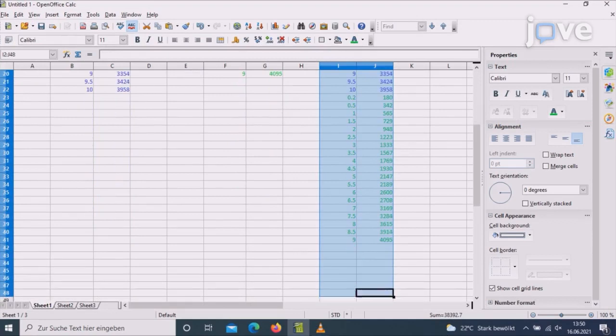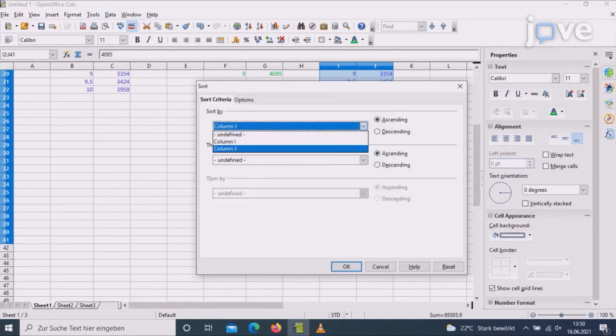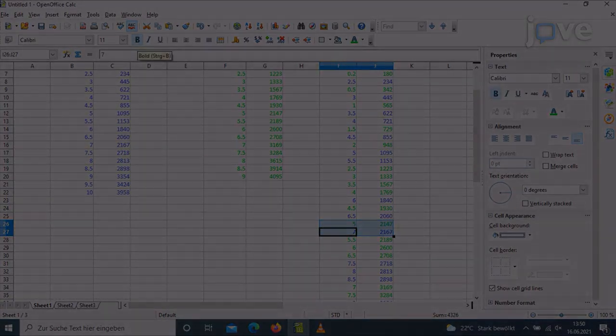For data evaluation, tabulate and sort the data by signal intensities, then plot the signal intensities against the relative laser power, and choose the laser intensities resulting in a similar signal intensity.